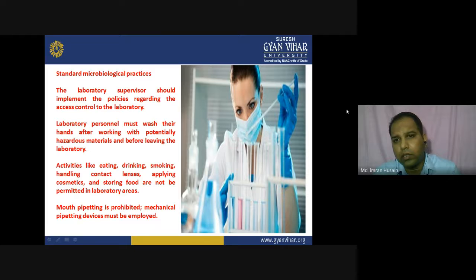These are some of the most important hygiene practices that should be immediately adopted by the students, research scholars, or trainees. So they should always wash their hands whenever they touch hazardous material and before leaving the laboratory.